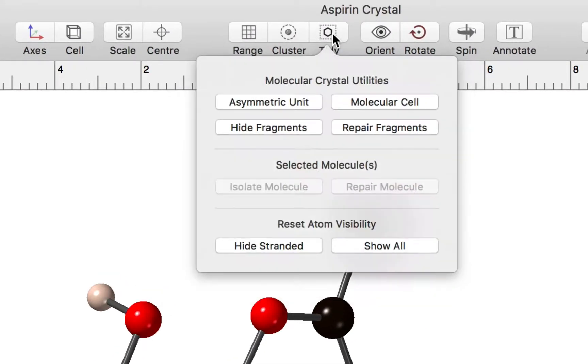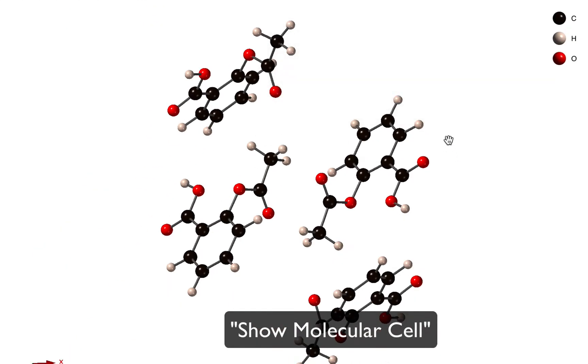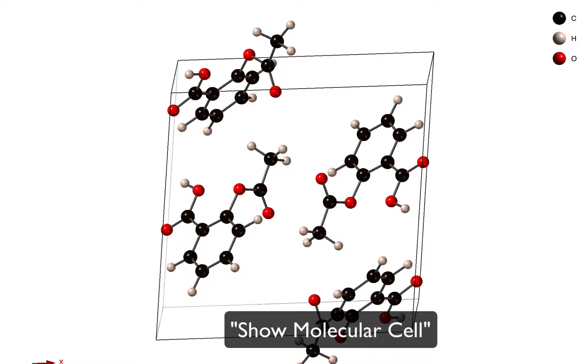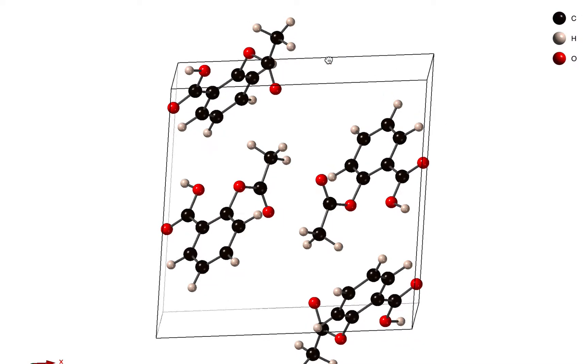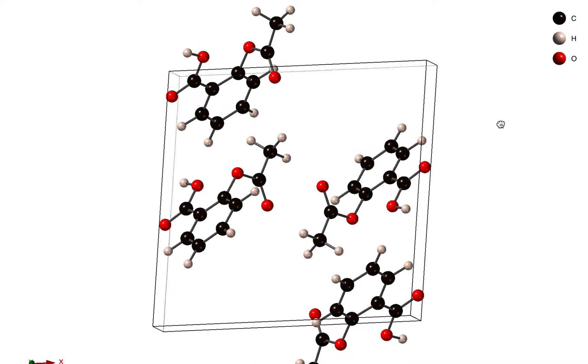We also have a nice command called molecular cell. If you click that, this shows the complete contents of one unit cell but optimized to ensure that we have intact molecules.